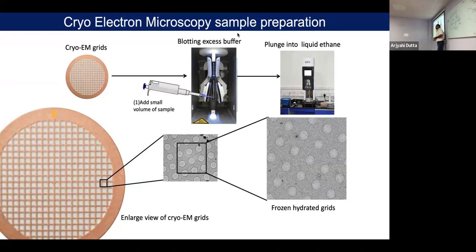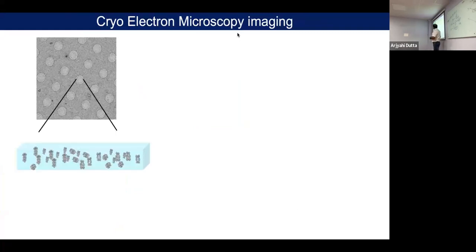And now the good thing is that it is not dehydrated, it is in frozen condition, right? So we are targeting the individual holes here. Okay, if we look at this individual hole, as I mentioned, you will see an amorphous ice layer. Within that, the protein is embedded. So you are baking a cake and you have cherries or nuts, you are putting them in, and they have different orientations. Same thing. Just consider that it is a cake and the protein has different orientations.